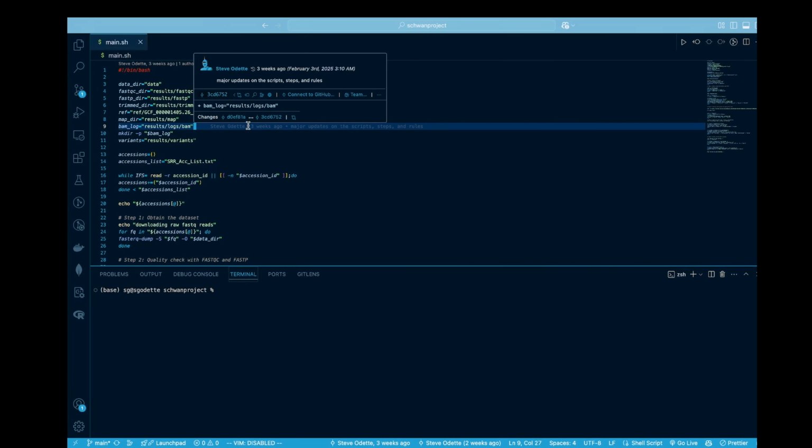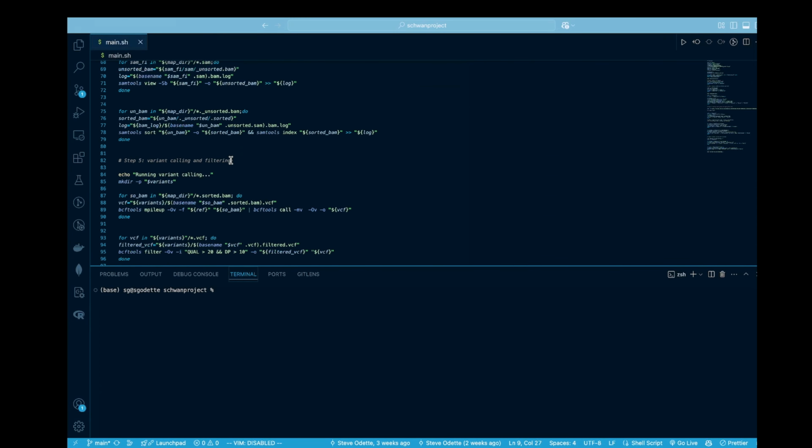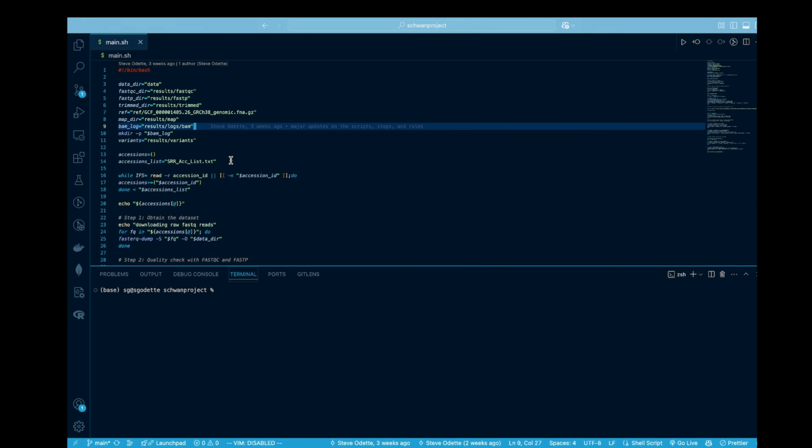Now, with that said, let me head over to my Visual Studio Code to show you just a flow of how we'll be working throughout the entire series. During my tutorials, I'll start by giving the simplest way of doing the analysis and then proceed to show the best and the most advanced way of doing the analysis in Bash. And just to show you throughout the lecture, what we'll be aiming to do is to build this workflow from top here to the bottom. This will give us a good foundation on Bash that we can now use in Snakemake. Now, that's pretty much it.